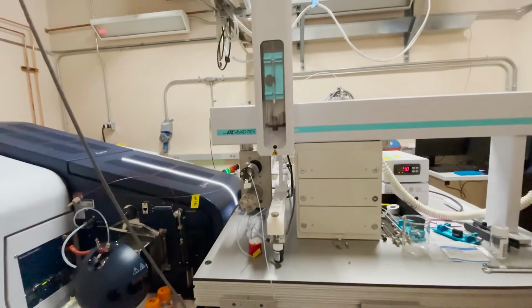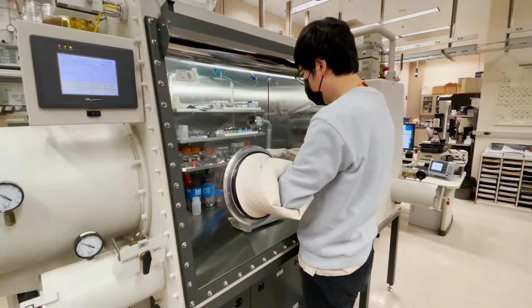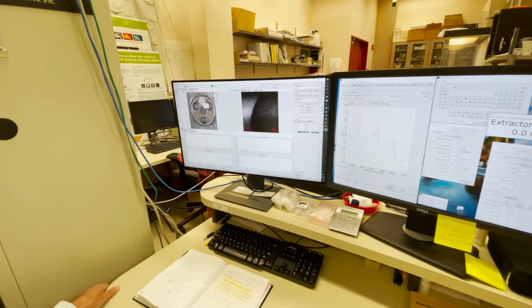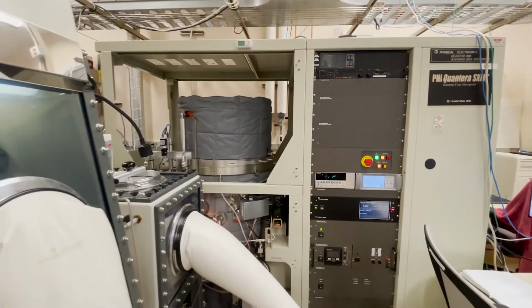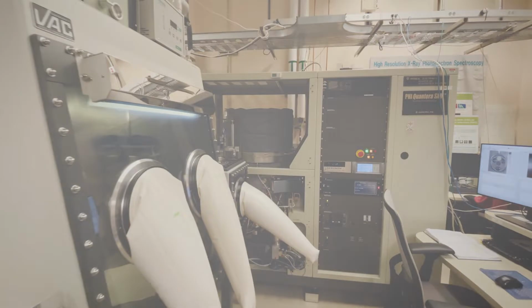We also have technologies that analyze spatial characteristics and mineralogies at sample. One example is the Quantum 2000 X-ray photoelectron spectrometer, which generates information on surface mineralogy at the micrometer scale. Along with tomography and microscopy, these instruments provide a holistic understanding of biogeochemical systems.